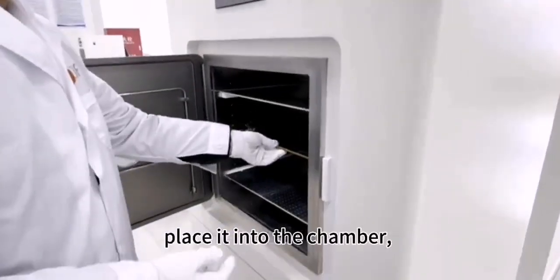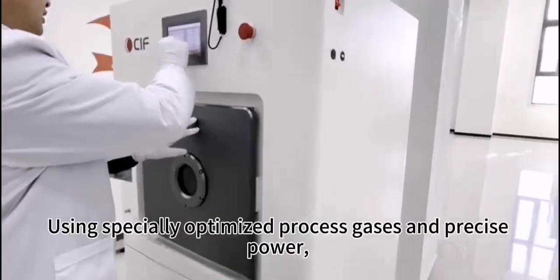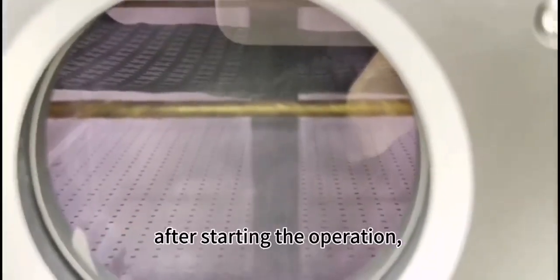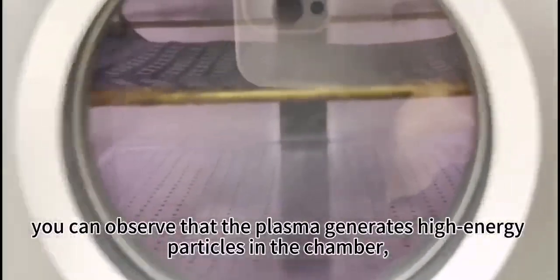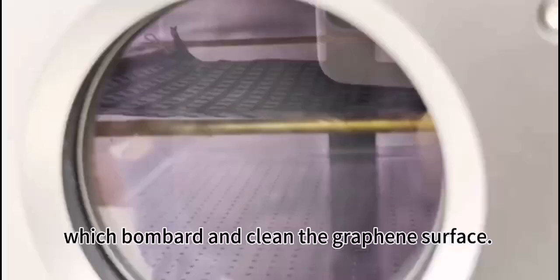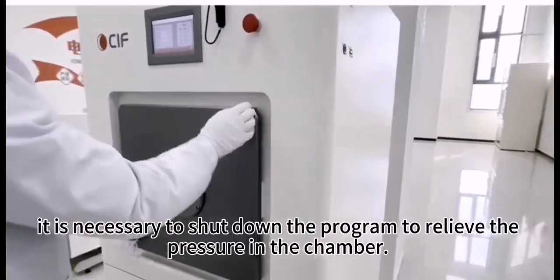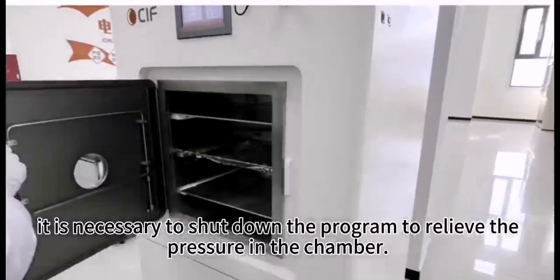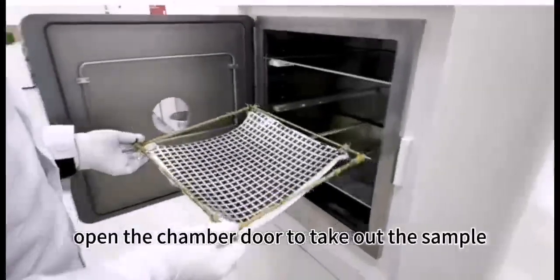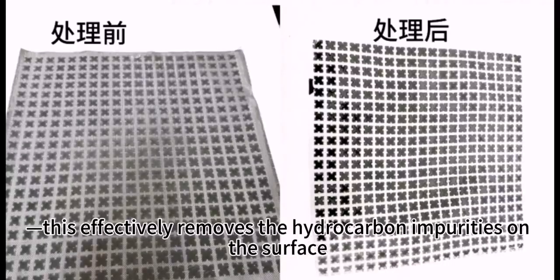Place it into the chamber, close the chamber door and set the parameters, using specially optimized process gases and precise power. After starting the operation, you can observe that the plasma generates high-energy particles in the chamber, which bombard and clean the graphene surface. After the cleaning process is completed, it is necessary to shut down the program to relieve the pressure in the chamber. Subsequently, open the chamber door to take out the sample. This effectively removes the hydrocarbon impurities on the surface.